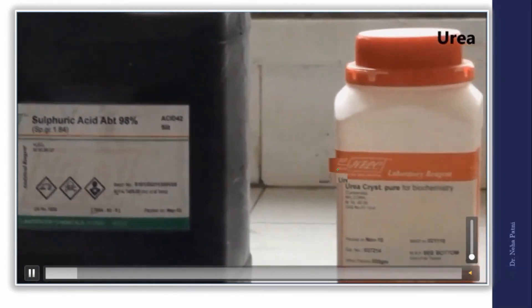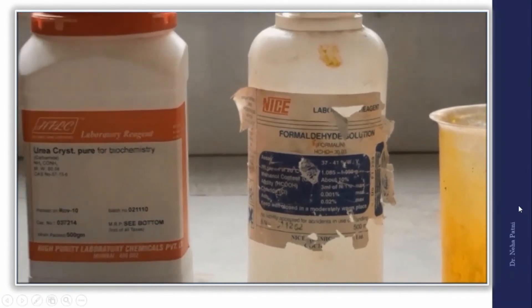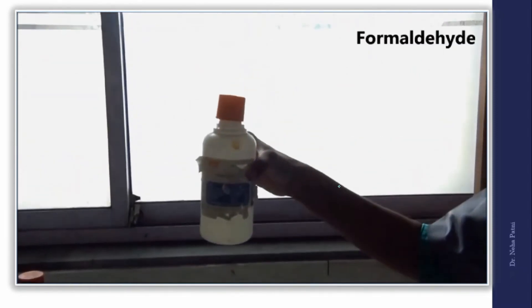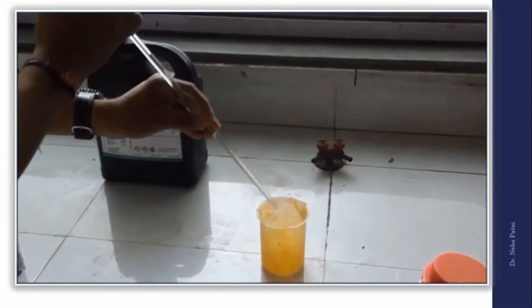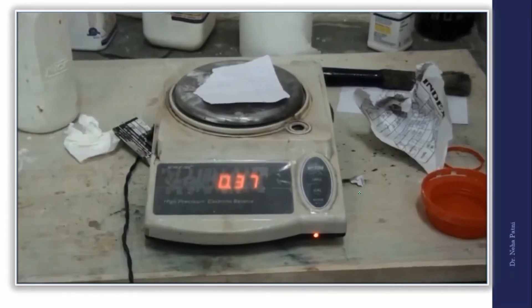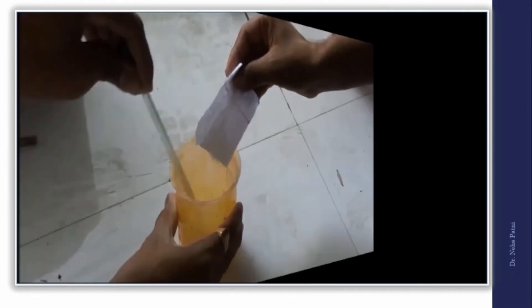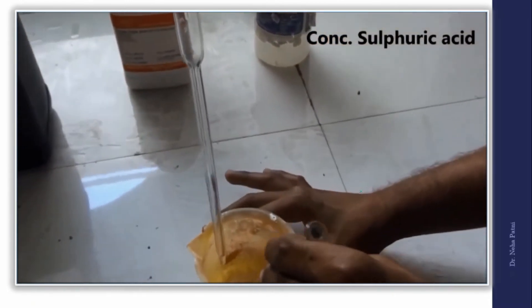In the demonstration: concentrated sulfuric acid, urea (NH₂CONH₂), and formaldehyde (formalin) are shown. Take a beaker and use a pipette to measure 10 ml of formaldehyde solution and add it to the beaker. Then measure around 5 grams of urea on the weighing scale and add it to the formaldehyde solution. Stir with a glass rod until it becomes almost transparent and the urea is dissolved.